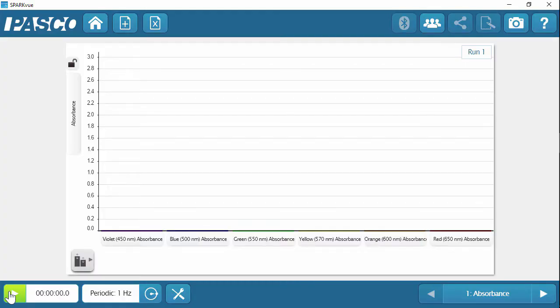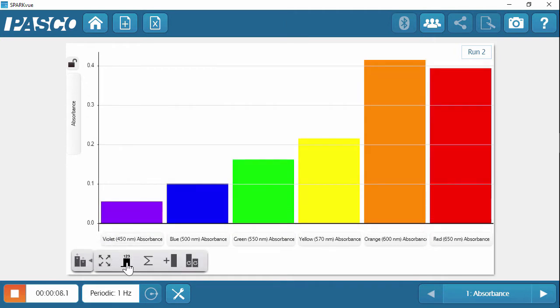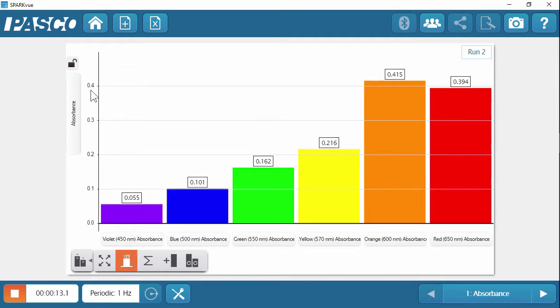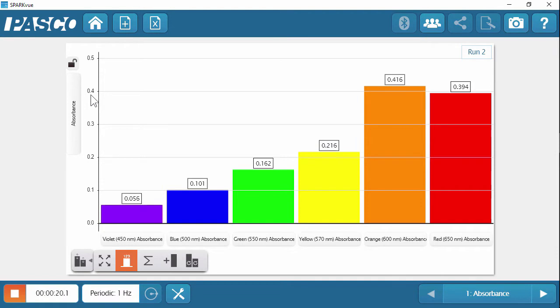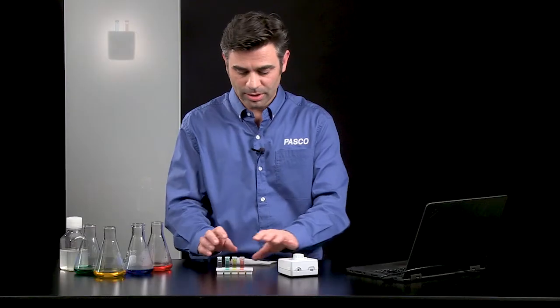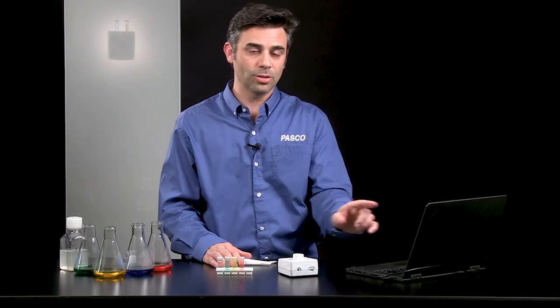And there's my blue solution. And I'm going to use a graph tool to auto scale that. And I'm going to put the number display show values onto those bars also. Now you notice something interesting, and this is a great thing to teach your students and to have them figure out. You'll notice that the blue solution does not absorb mostly blue light. It actually absorbs mostly orange light. And this is one of the things you want to teach with a colorimeter is that the complementary colors are what's important when you're talking about absorbance.